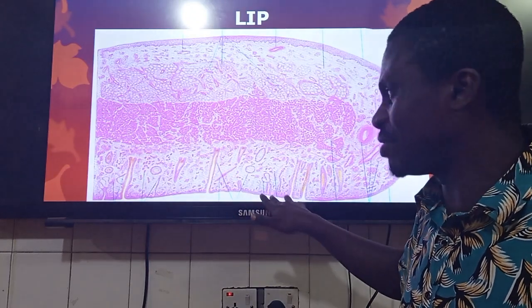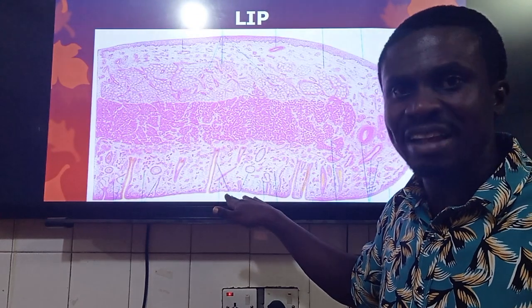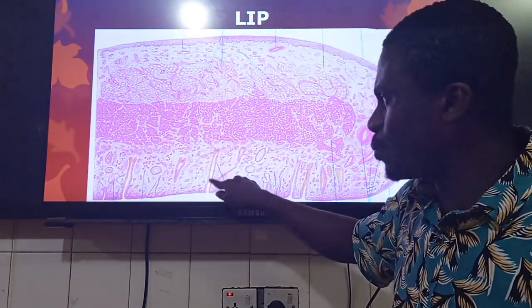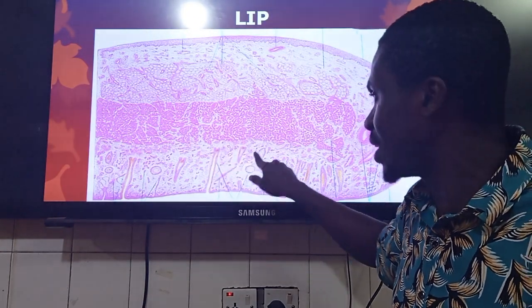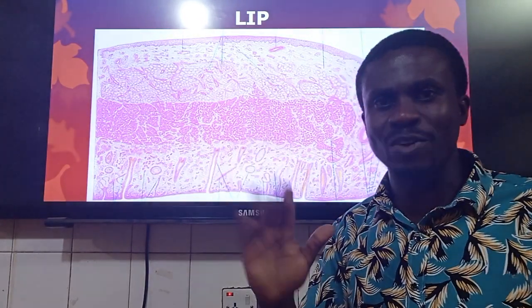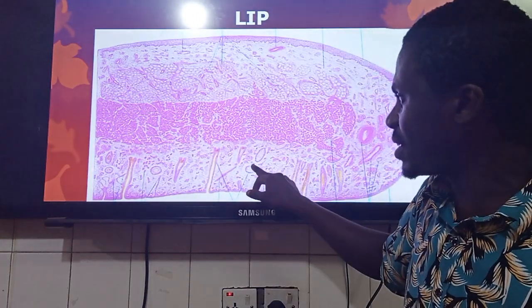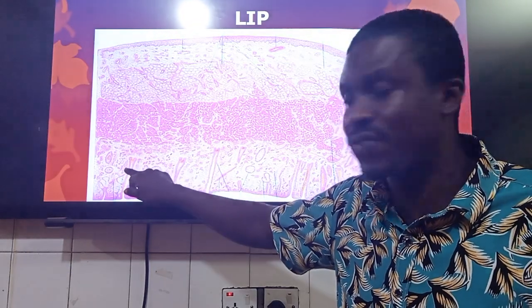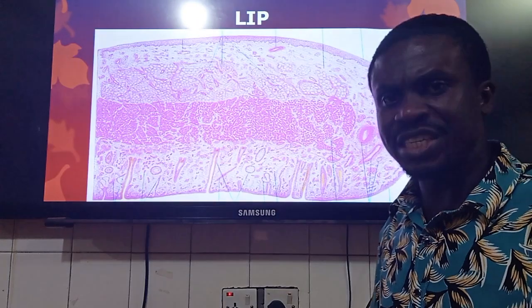Although we don't see the keratin so well, that's the artistic viewpoint. We are supposed to see a layer of keratin over here. But regardless, what we are going to see are these structures that we find over here, showing you these for the longitudinal sections, and these are the transverse sections. Yes, I've done videos on the skin, so you can get those videos, and this is a rapid section for you. So one thing we will see is that these are what we call the hair follicles, sectioned in either transverse section or longitudinal section.